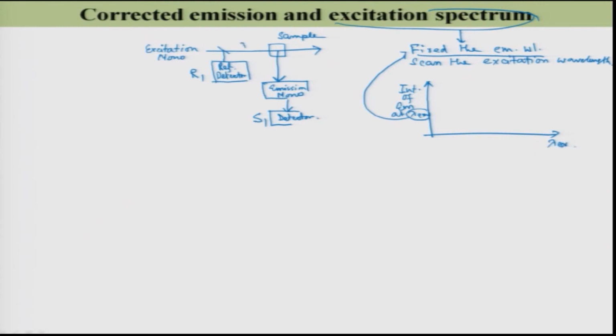Here is your lambda excitation. In this case you are going to see some spectra like that, and I said that this spectra is the same as the absorption spectra of the molecule.